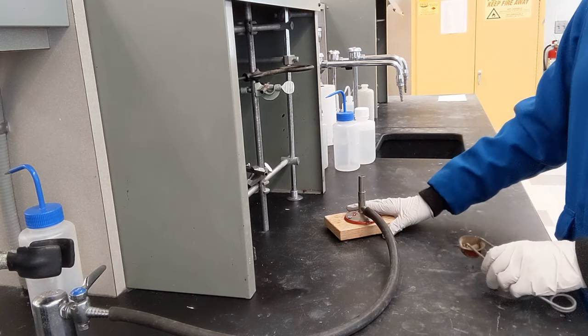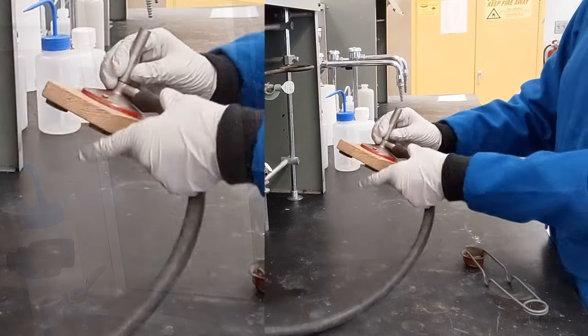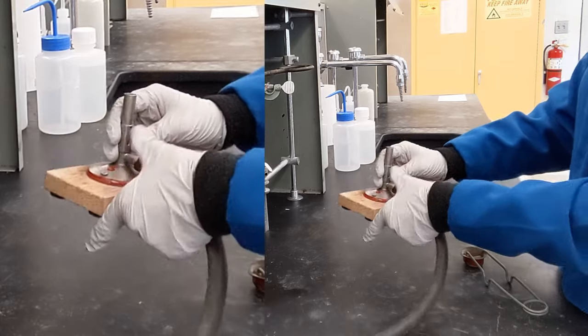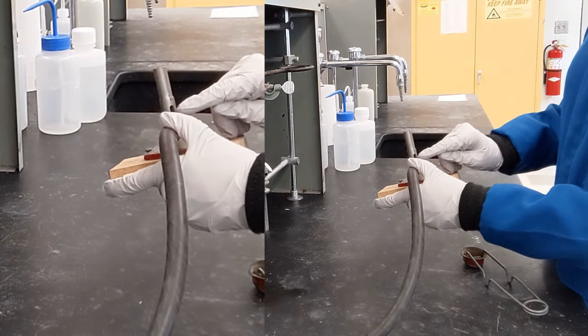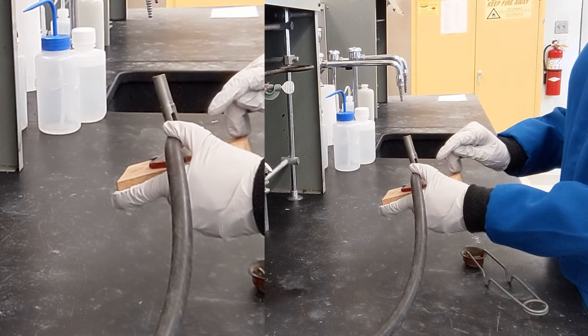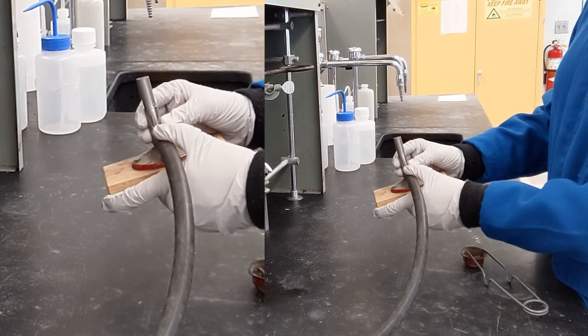Now the Bunsen burner. There is a collar that I can turn to control the amount of oxygen that gets inside. So right now it's all the way open. This should allow the maximum amount of oxygen to get in.